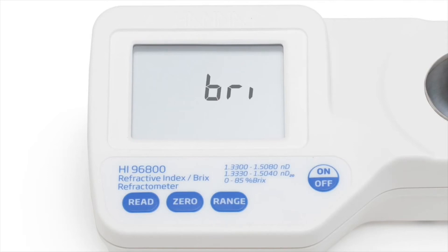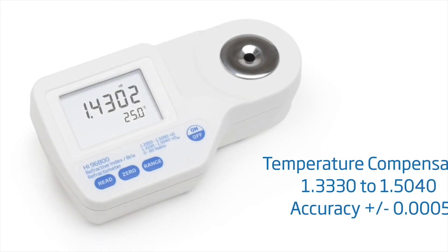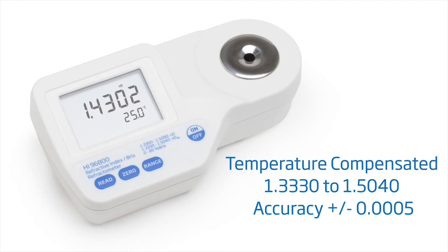The appropriate tag for the range selected will be displayed. For temperature-compensated readings, the refractometer will display results between 1.3330 to 1.5040 with an accuracy of plus or minus 0.0005.